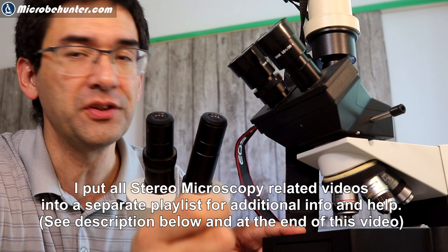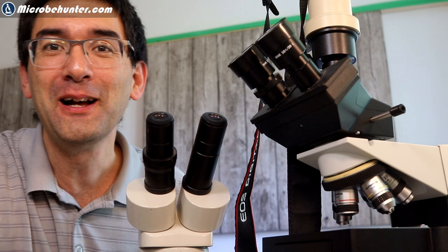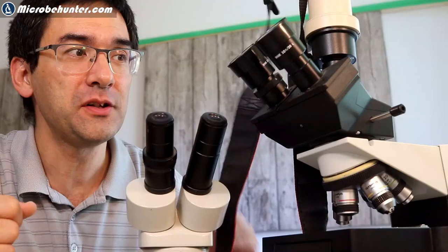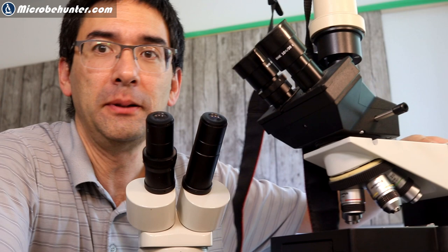With a compound microscope, the object has to be very thin and very small. You cannot do that with a spider, because most likely you do not want to dissect the spider — you'd like to take the whole animal, look at it, and then maybe release it again. So compound microscopes are not suitable here; we're going to completely forget about them.